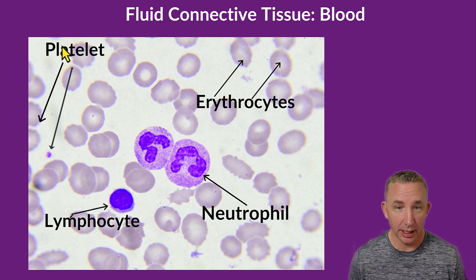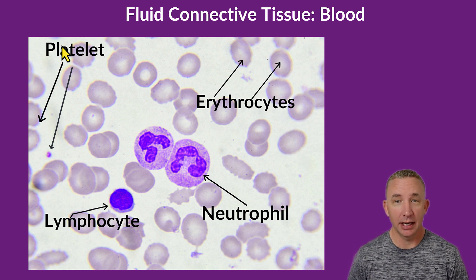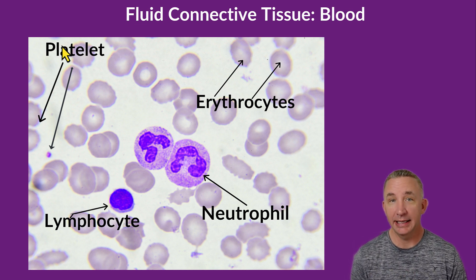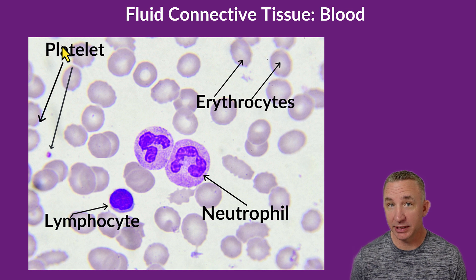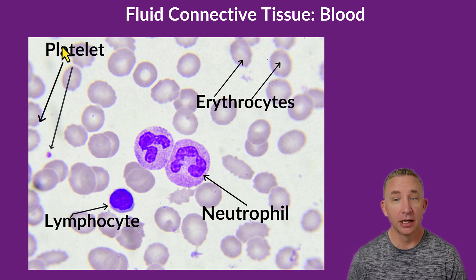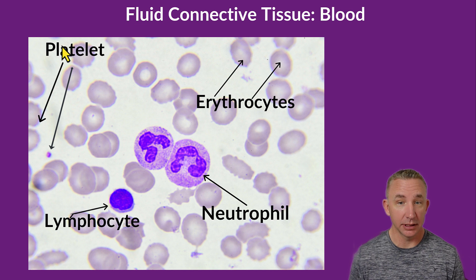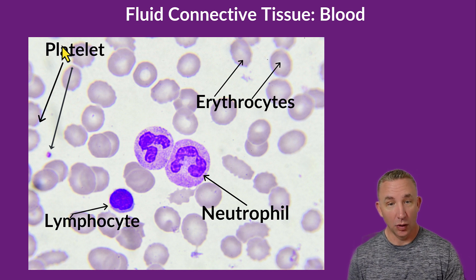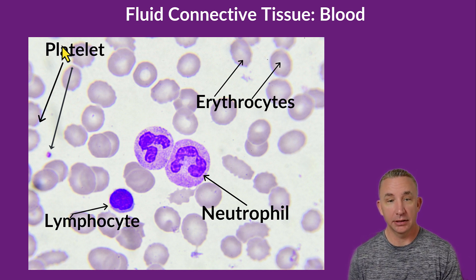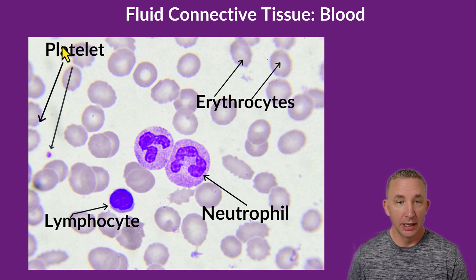Here we're looking at blood, and since I see a bunch of pink bubbles, I know that's my blood because 99.9% of all the formed elements — the cells in blood — are erythrocytes, and erythrocytes are red blood cells. All of these pink little bubbles throughout the slide are erythrocytes, transporting carbon dioxide and oxygen.